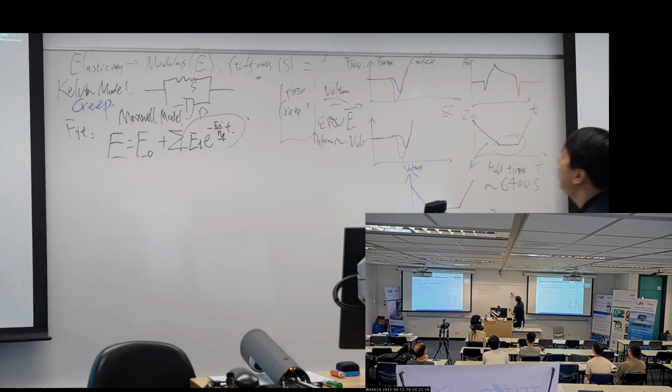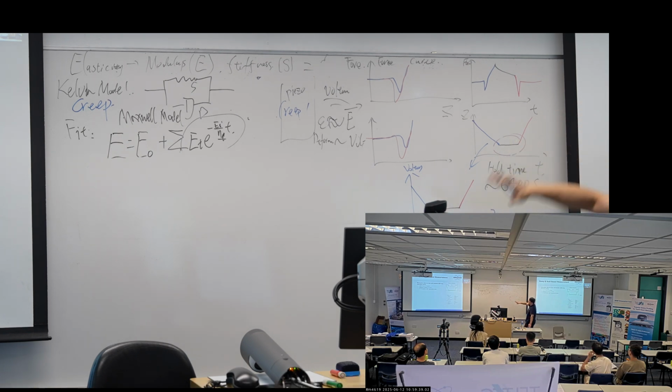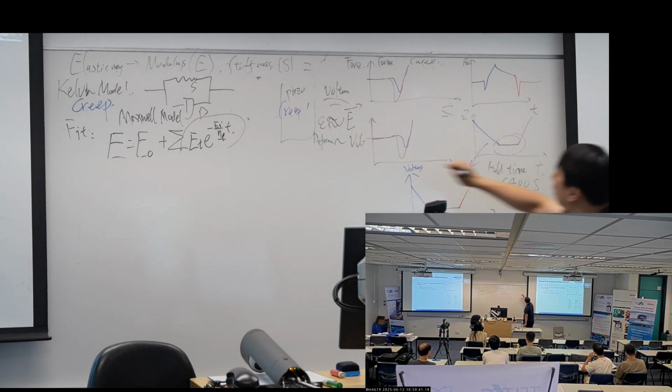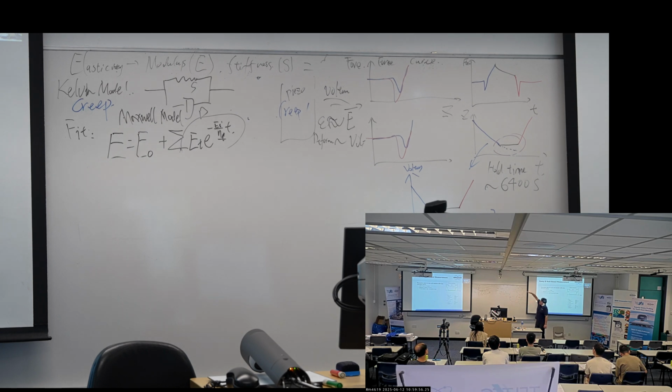But the real situation will be the scanner will keep going due to the creep. So we usually would observe the Z is continually moving down. So ideally, I want to move my piezo linearly to reach this height. And I want to hold this height for a while and then moving up.